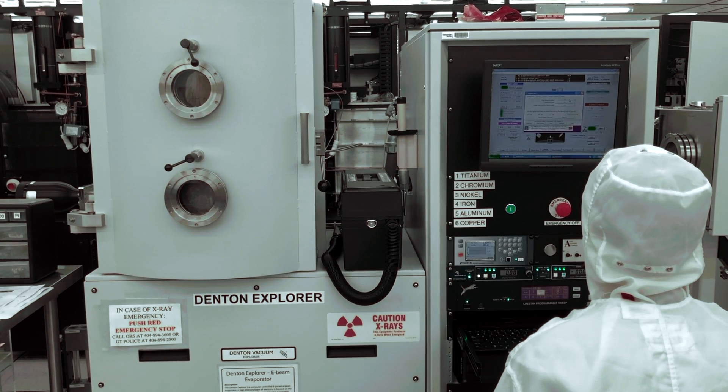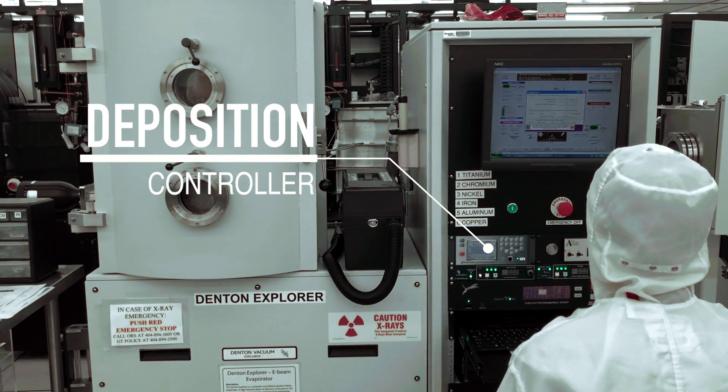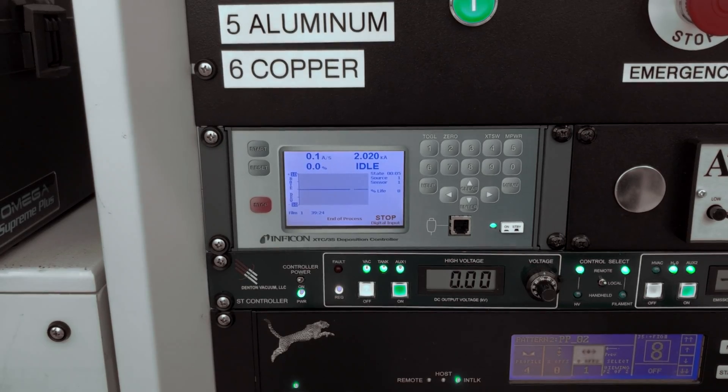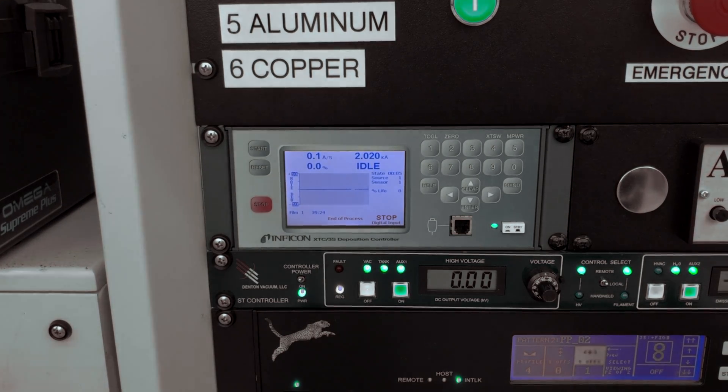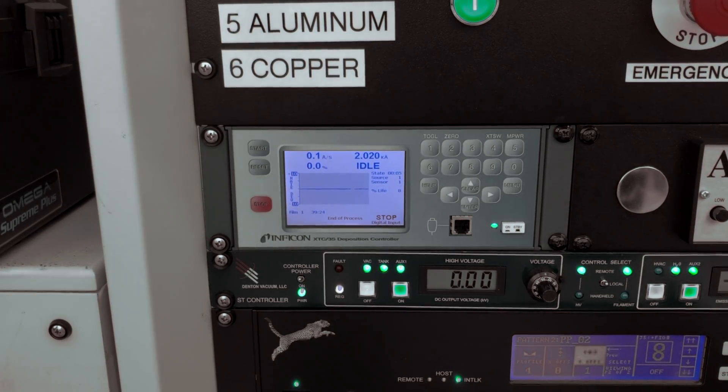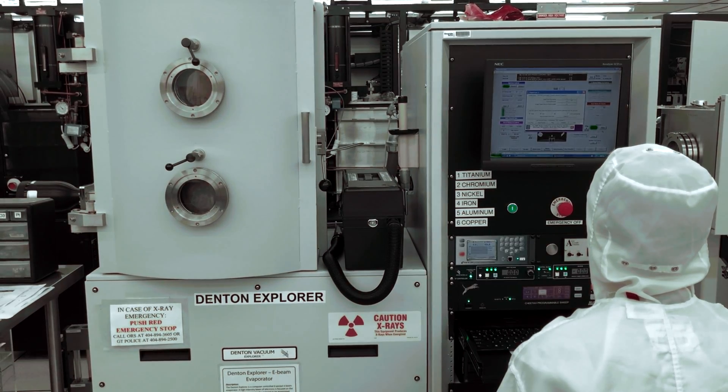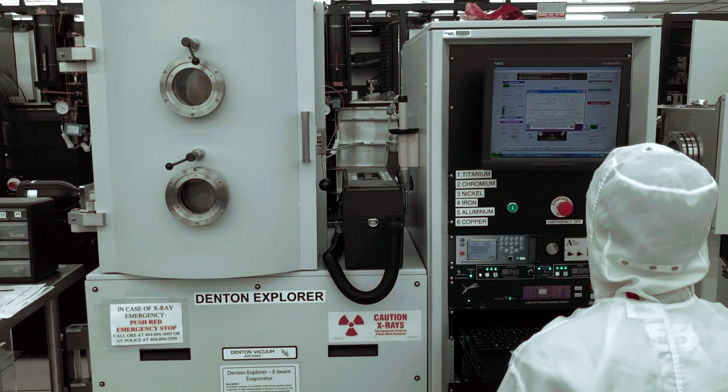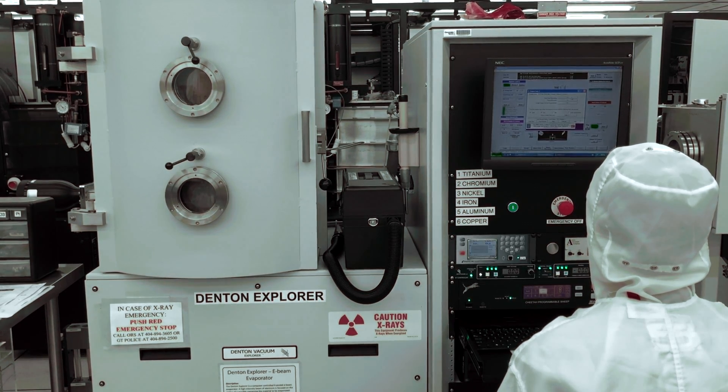Finally, the deposition controller allows the operator to change the thickness and deposition rate. It also displays the crystal life percent. However, this information is also displayed on the overview screen as well.